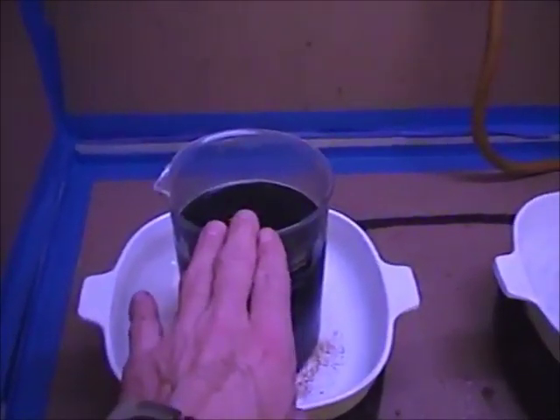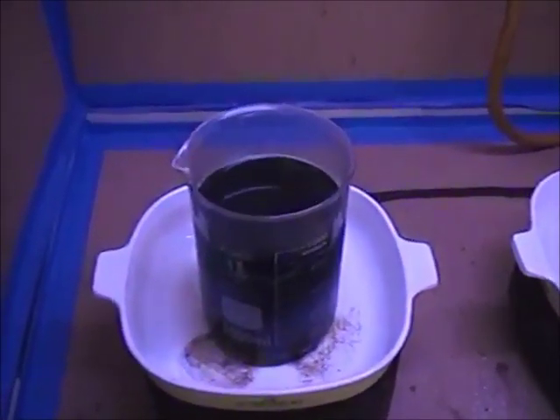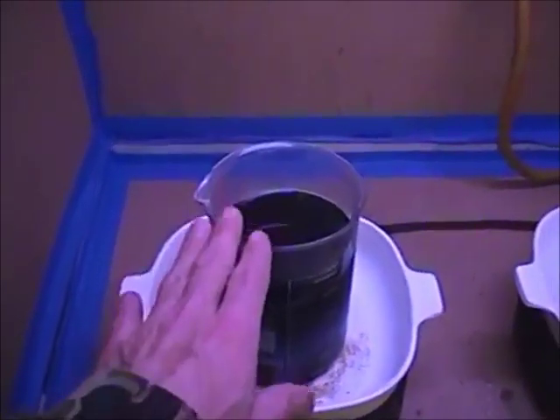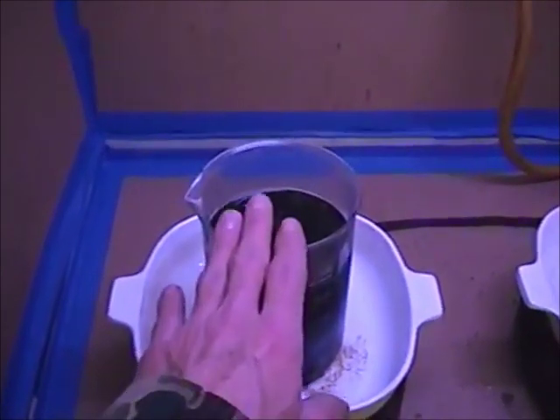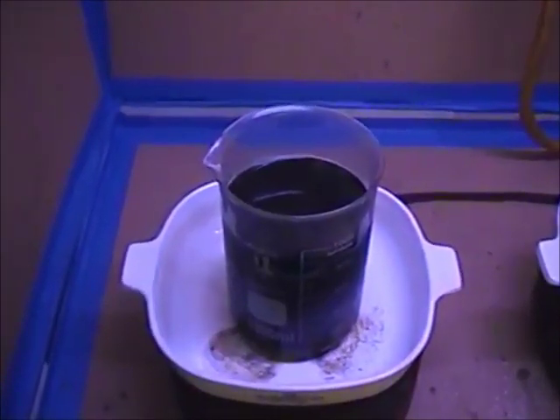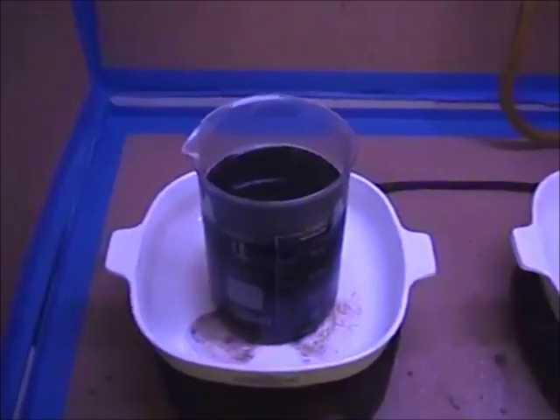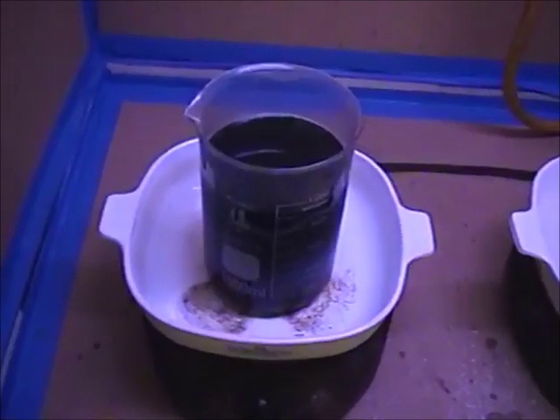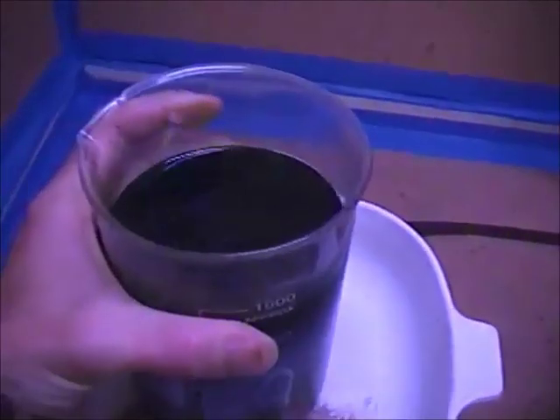This beaker has been sitting out in my lab where there's no heat, and the temperature has dropped down to 30 or 40 degrees on a couple of nights. The colder this is, the less solubility you have in this solution for metals. So that could be metals, that could be a lot of things. I triple filtered this solution to make sure it was good and clean. From it setting over a period of time, you will notice we have some sediment in the bottom, almost like a fine, powdery, clay-like substance.